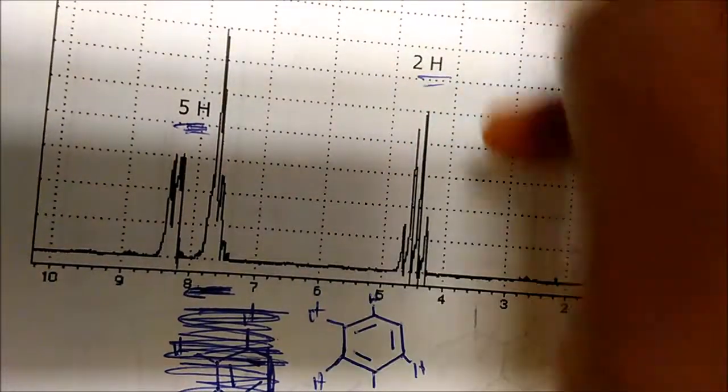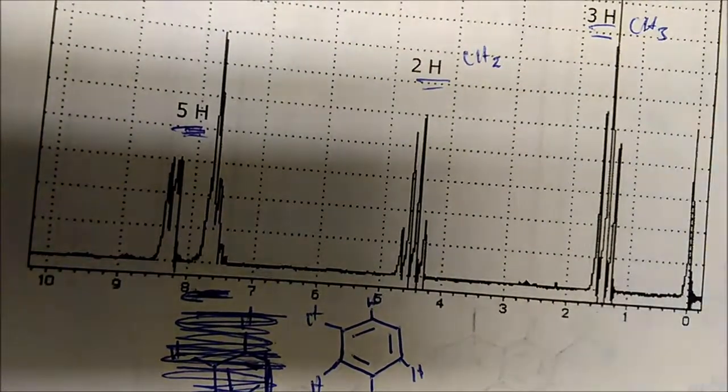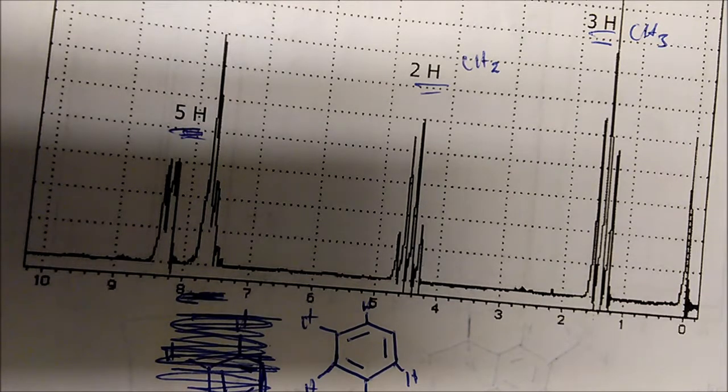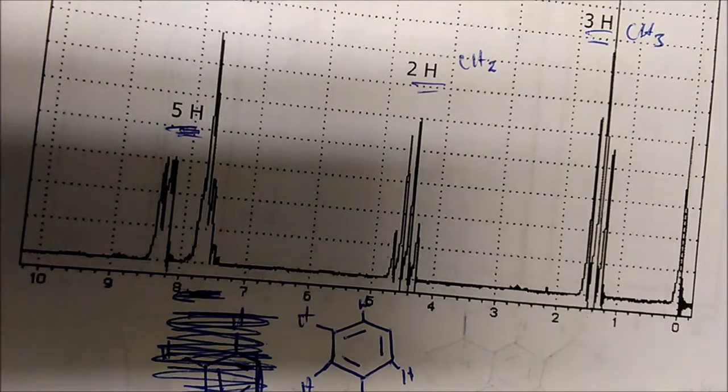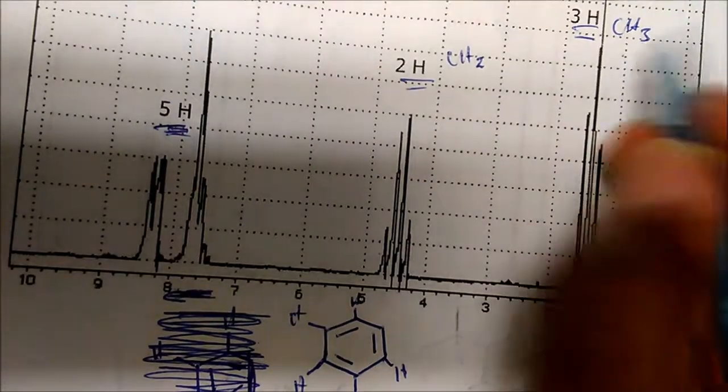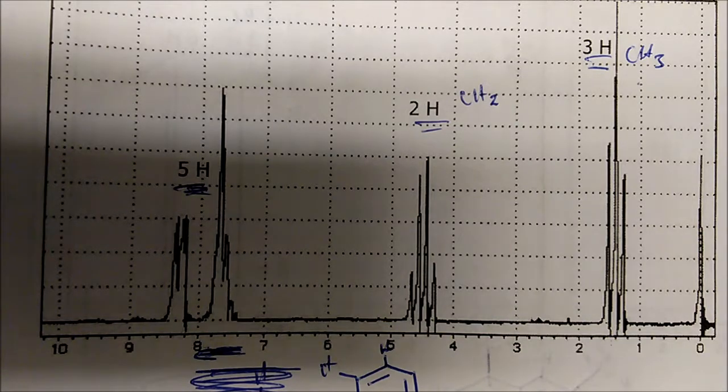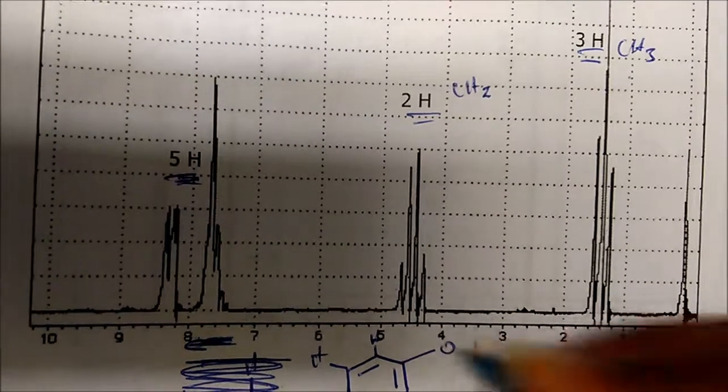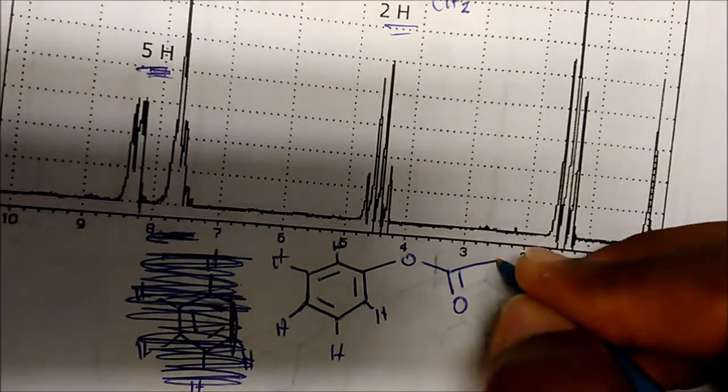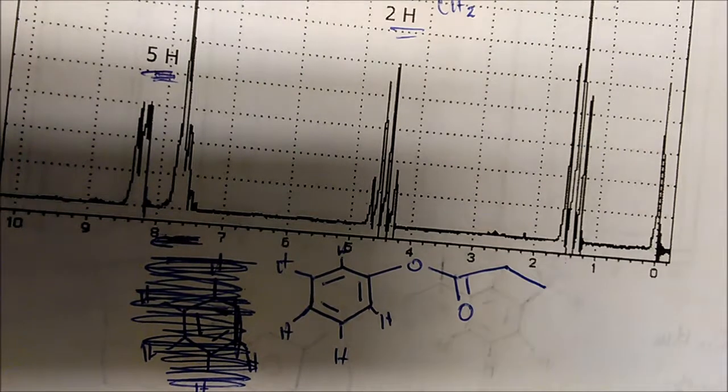I see that I have two hydrogens here, which means this has to be a CH2. And I have three hydrogens here, so this has to be a CH3. Now, this splits one, two, three, four times. And this splits three times - one, two, three. So I'm looking at this and I'm saying, well, these have to be neighbors. These have to be neighbors. So therefore, I have two oxygens in my molecule. If these have to be neighbors, there's only one way I'm thinking I could go about this molecule. I'm going to draw a bond to my oxygen, I'm going to put a carbonyl group there. I have a CH2, that's a CH3. Now, look - they're neighbors.